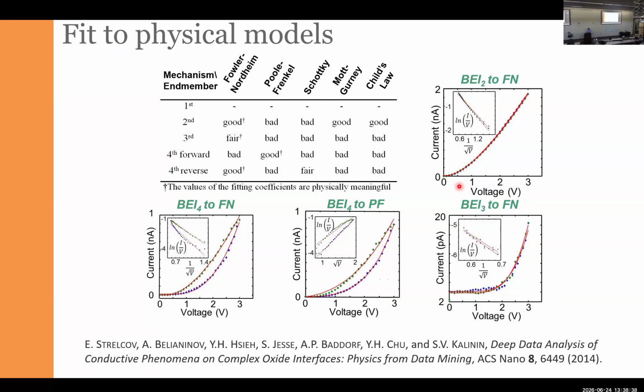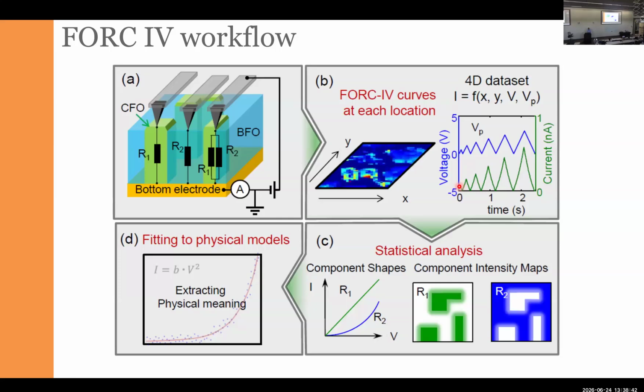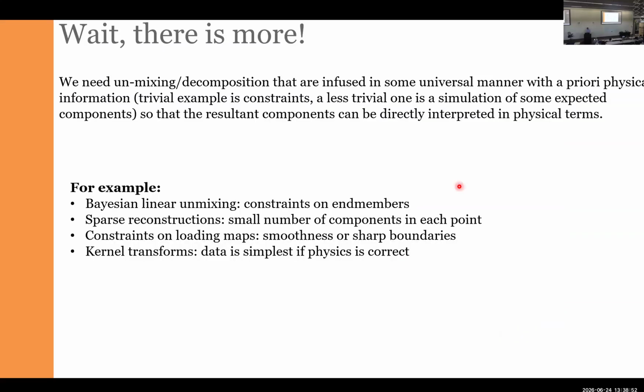Of course, we can do a next step and try to fit it to a physical model, but that's where things become a little bit more questionable, even though nominally we can do that because our signal generation mechanism is linear, therefore we can interpret the components as well.